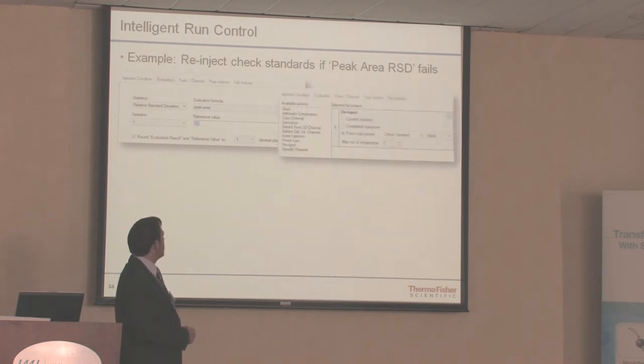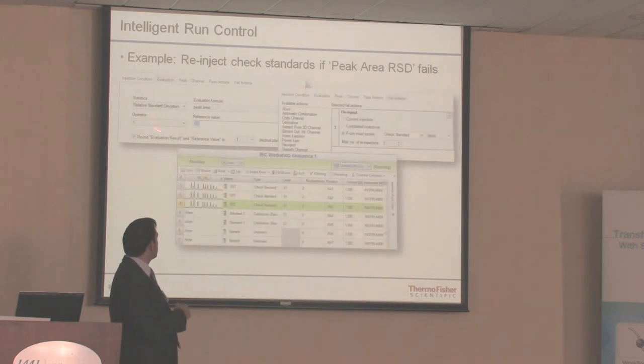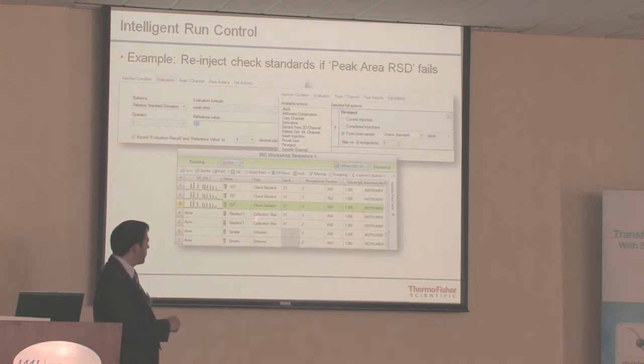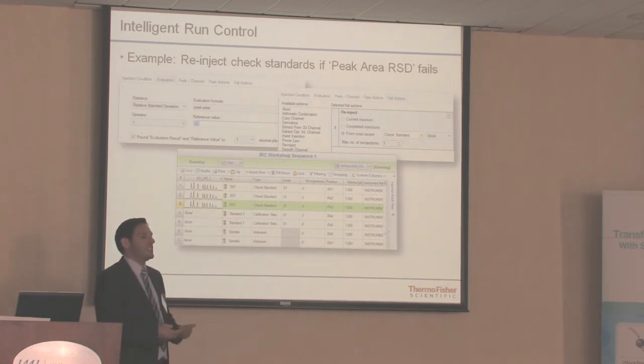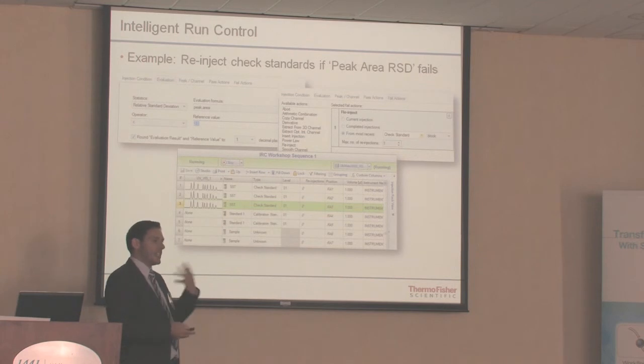And like we said, the example we had about the RSDs, this is what you put into the statistics, this is what you put in for your re-injection, this is what it looks like live. So not only does it actually insert the injection, so it gives you 3 more or 1 more, it actually puts this column here, the number of re-injections. Now this one's currently running, but when it's finished that will say 1. So it's immediately evident about which one's been re-injected and how and why, so you can interrogate.